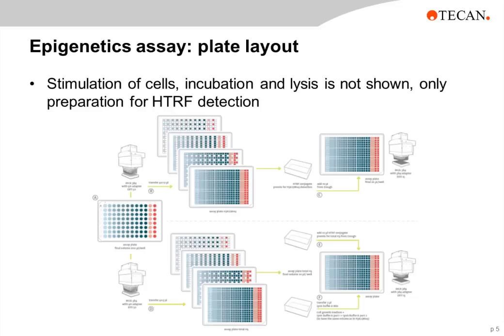It is not necessary for you to read everything that is in the graphics. It's really tiny font here, I know that. I just wanted to use that as an illustration so you can more easily follow my explanations. Everything you see here in this slide is after the cells have been stimulated, incubated and lysed. So this is just the preparation for the HTRF detection.